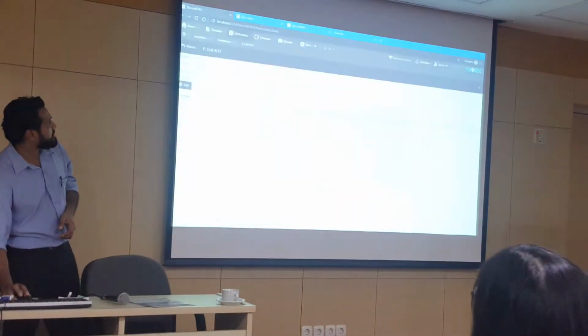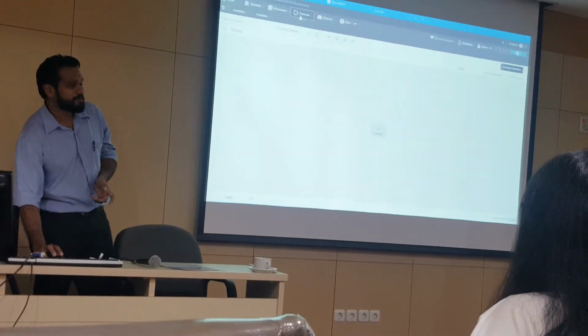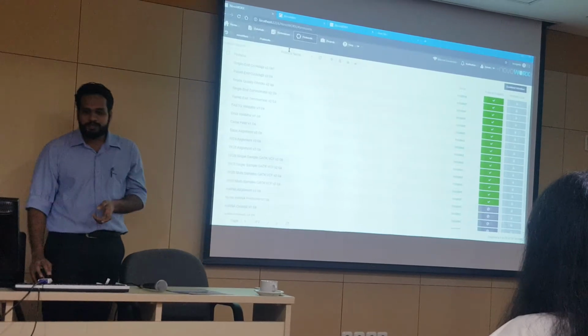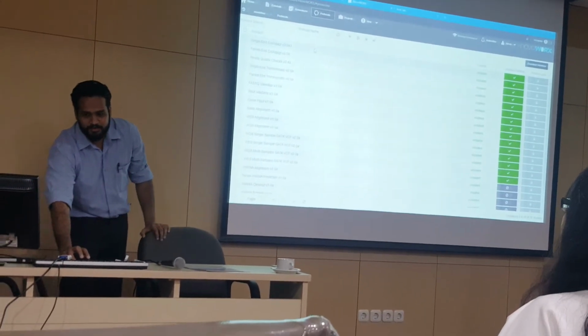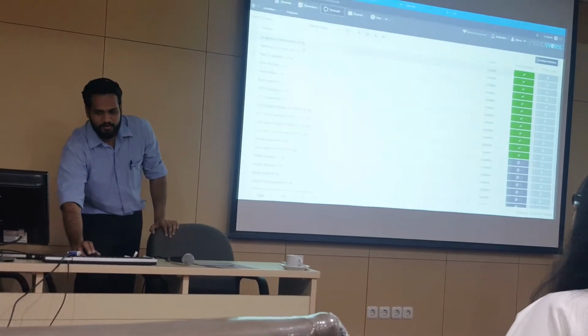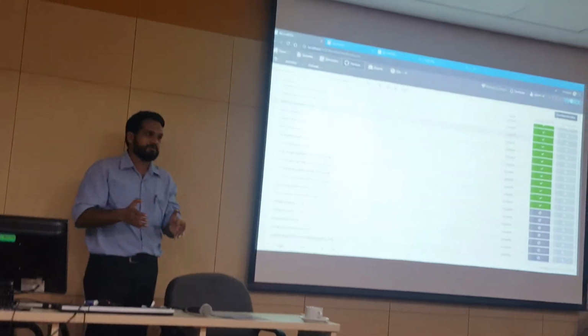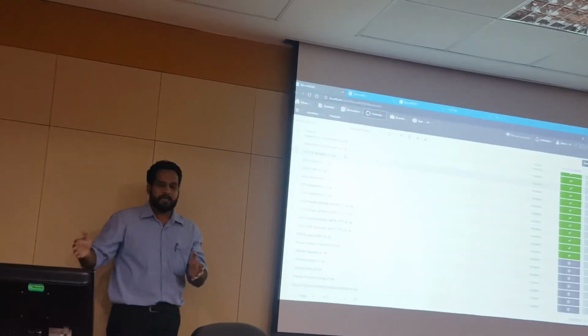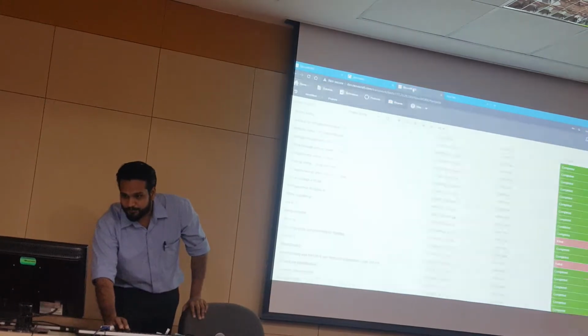So once you've saved your reference, the next step is to go to the protocols. Protocols in novoWorx are a bit different from the last time that we had this. What you can do is we've listed out all our protocols in the utility pipelines, the individual modules, and also the full protocols here. And for each of these, what you can do is just go and switch to another window.